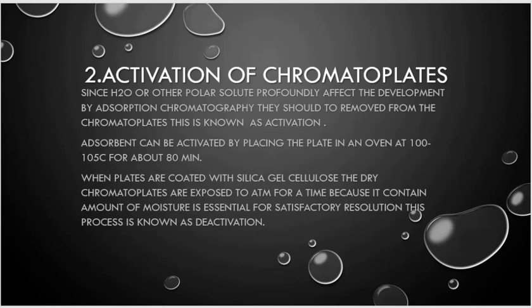In this, the adsorbent can be activated by placing the plate in an oven at 100 to 105 degrees centigrade for about 80 minutes. Activation starts when we place our plate in an oven at 100 to 105 degrees centigrade for about 80 minutes.